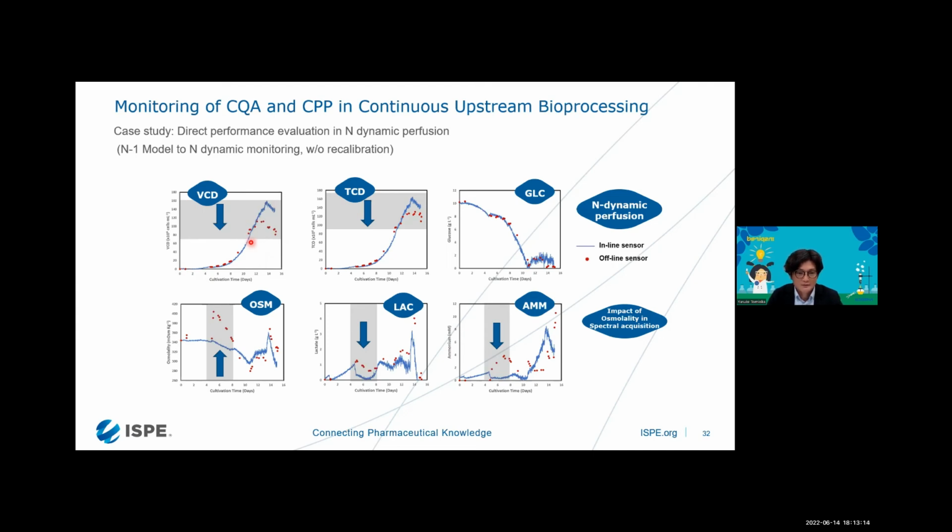And also during this evaluation, we missed an operation, so the osmolarity increased. But the Raman spectral inline monitoring result did not follow this error. Maybe this is because this chemometric modeling is not suitable for osmolarity detection.